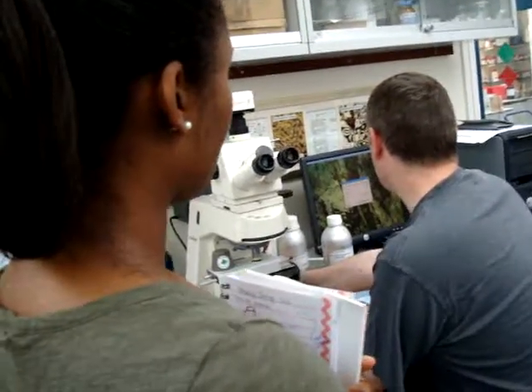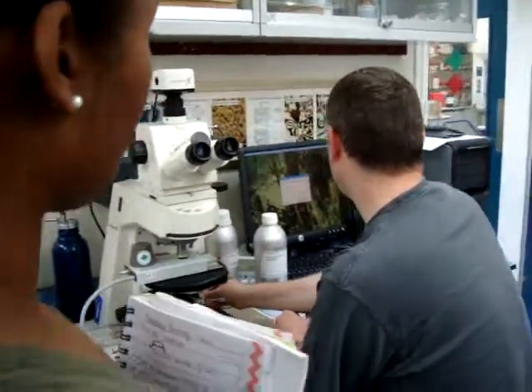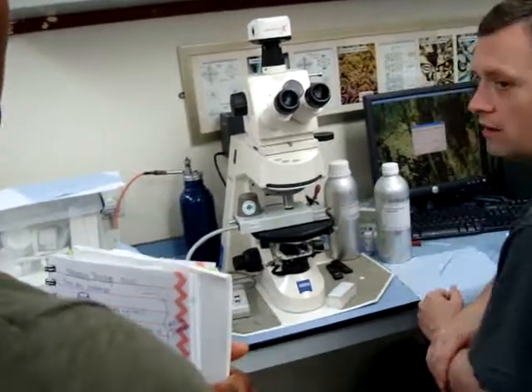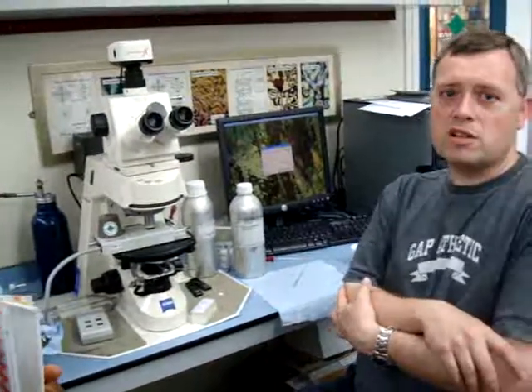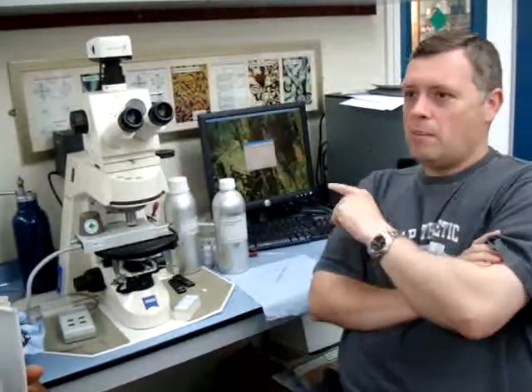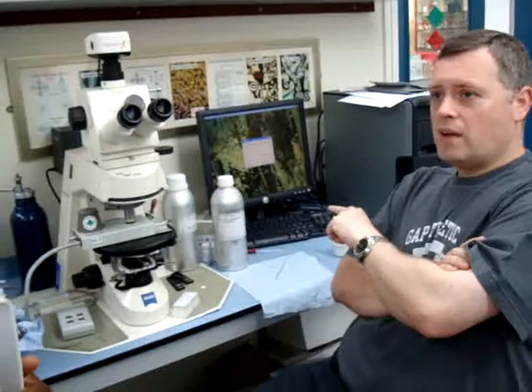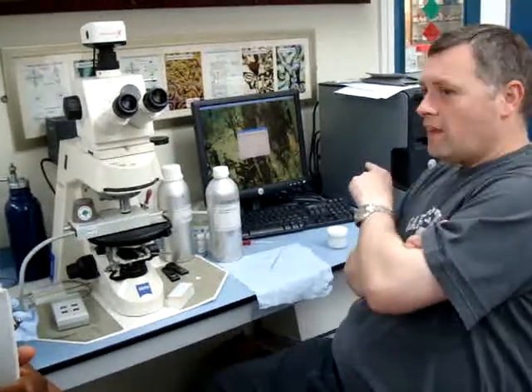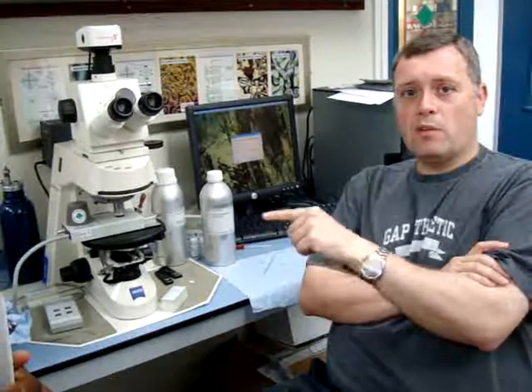At the moment all I've done is fill this by capillary flow. Now, when you're looking at liquid crystal samples, the one thing I would say is heat the sample up, get it to the isotropic liquid, and once you've done that, then try to identify the phases on the way down.